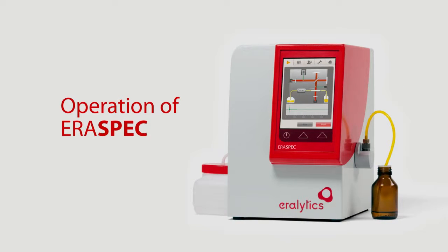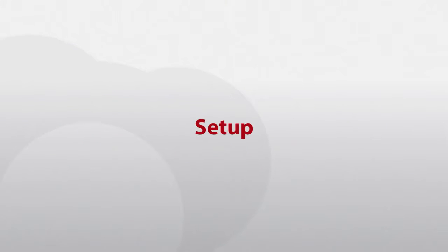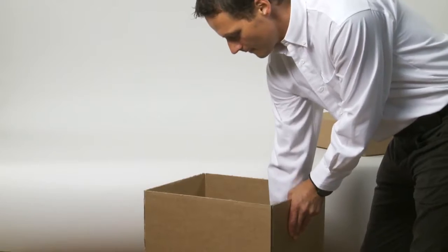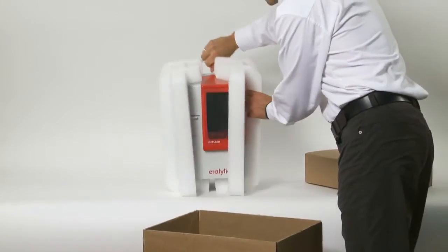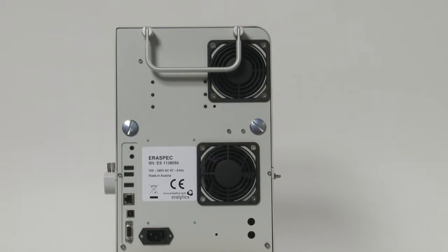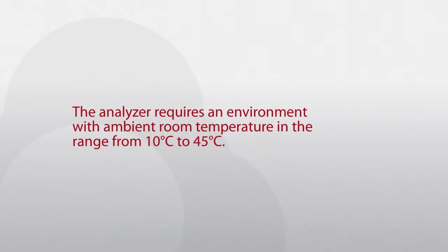Operation of Aerospec setup: After unpacking, place the instrument on a stable benchtop. Make sure that the vent holes of the analyzer are not obstructed. The analyzer requires an environment with ambient room temperature in the range from 10 to 45 degrees Celsius.